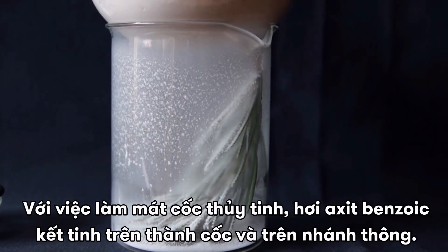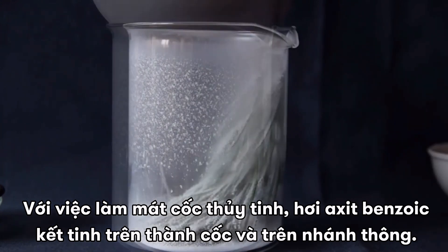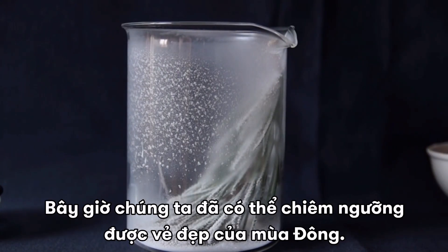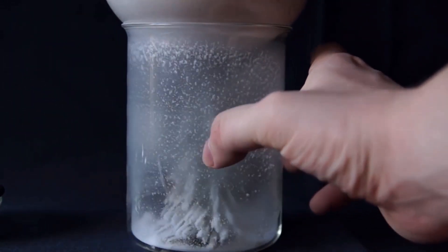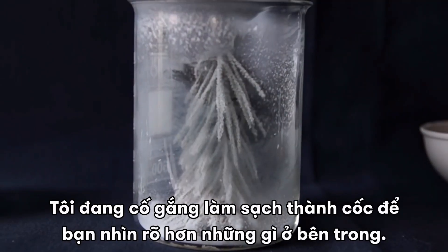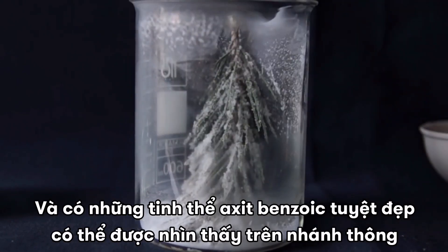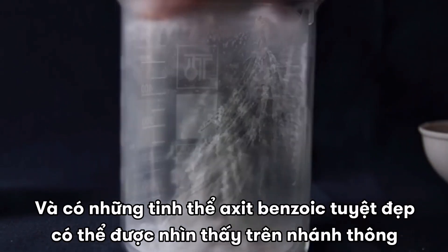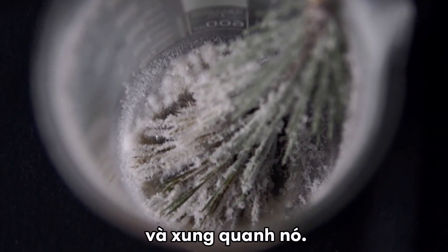With the cooling of the glass, fumes of benzoic acid are condensed on the walls and on the fir branch. We have now a beautiful visualization of winter. I am trying to clean up the glass wall in order to see better what is inside. And there are beautiful crystals of benzoic acid that can be seen to form on the fir branch and around it.